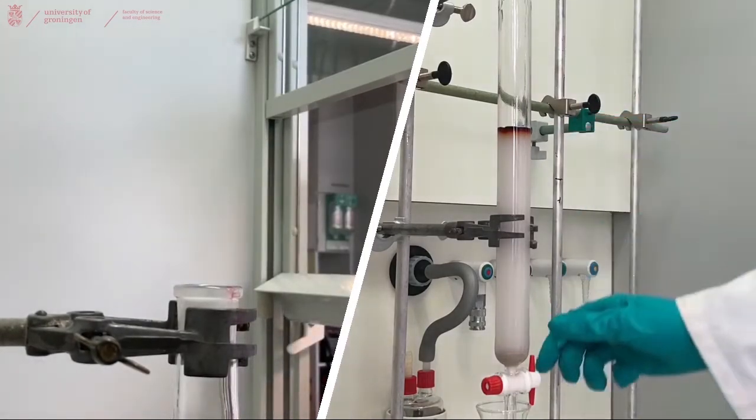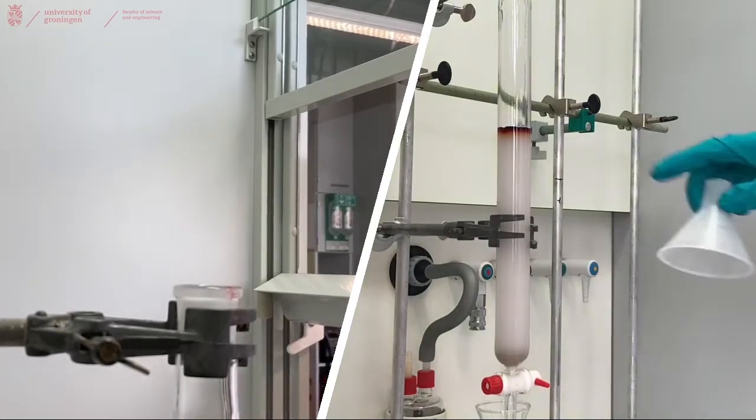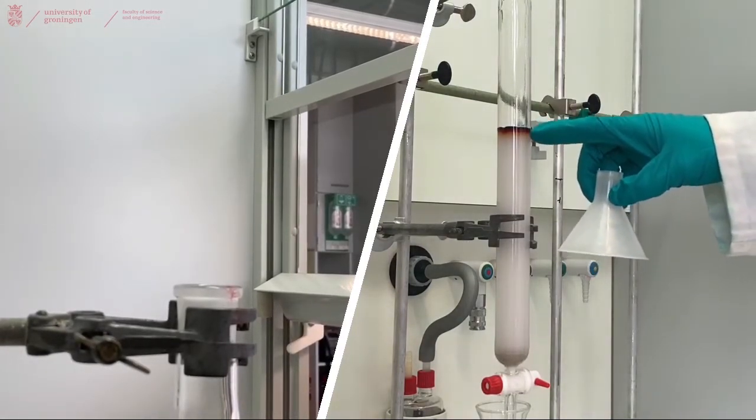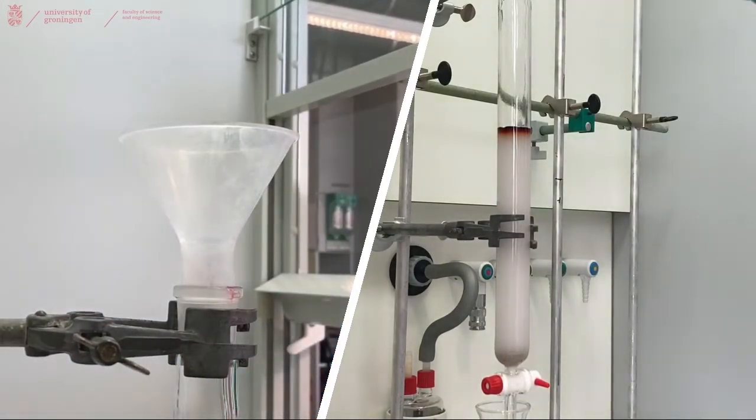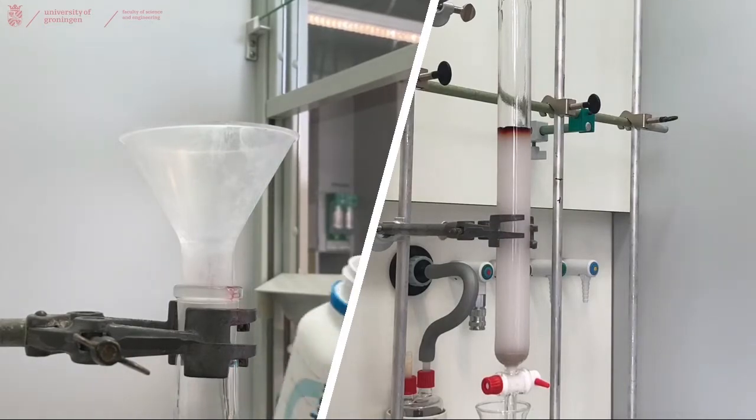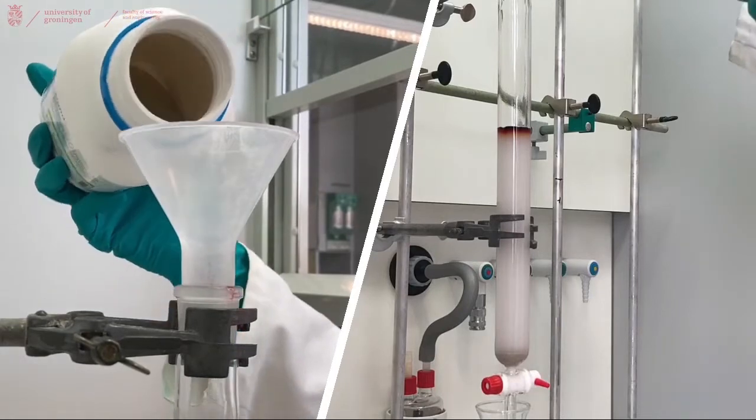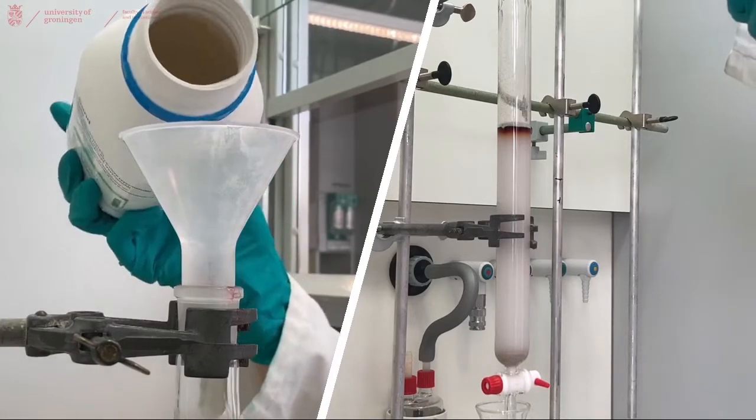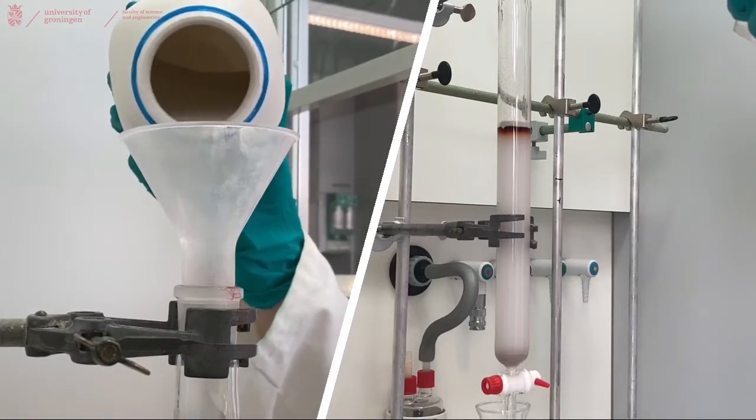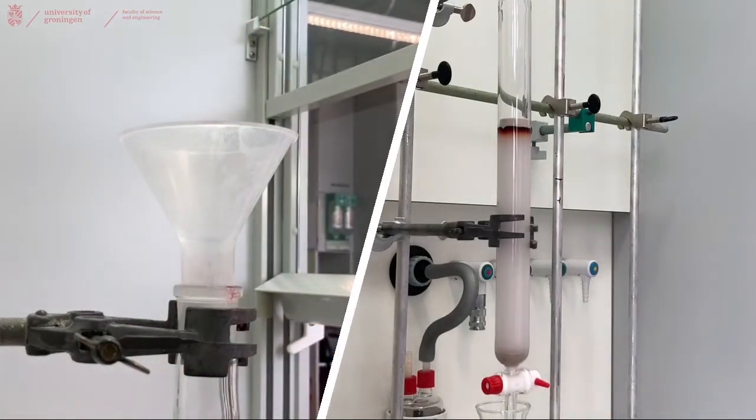Now that it's in the column, close the column and cover the top with a small layer of sand to prevent any compound going back into the eluent that you will place on top of your column. To do this, use a funnel for solids and the sand. And a small layer is enough.